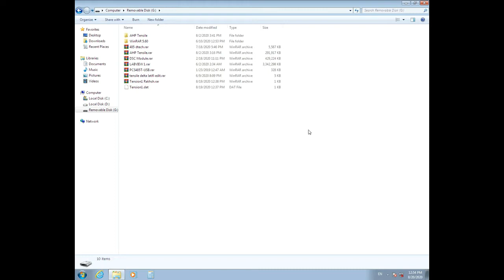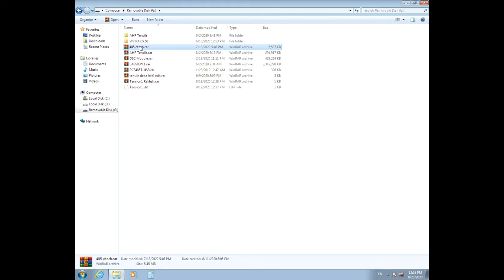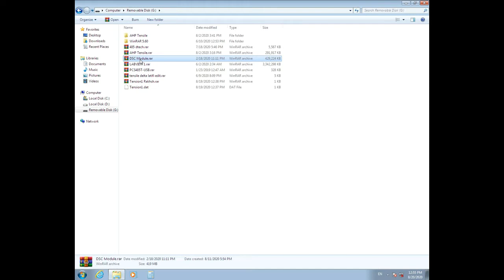You will see all the files and programs you need for your tensile machine, including AHP Tensile setup, RS485 converter driver, LabVIEW and DSC module software, and connection and calibration files and data.